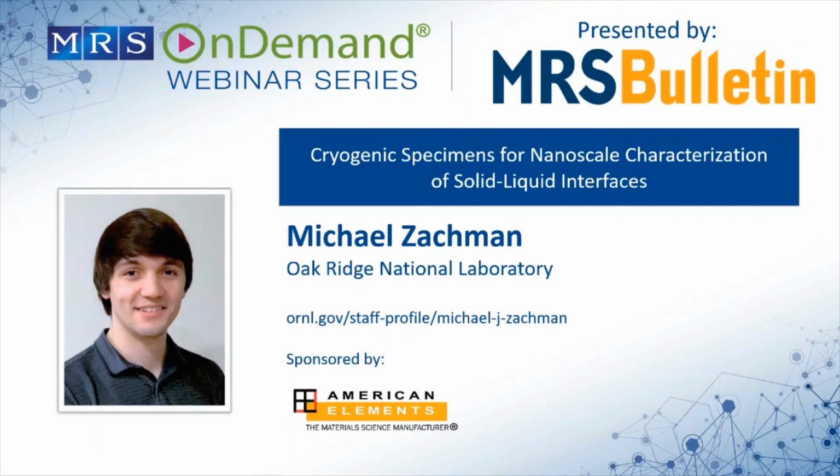I think they have quite a few papers that talk about breakdown of that molecule in the electrolyte. Okay. And then sticking with chemistry, the last question is, someone's asked, doesn't lithium react with nitrogen? And how do you avoid issues with that? I have to say, we worked with Lynden Archer's group at Cornell, and this was the very first question he asked us. Because it's a very good question, a very important question. So what we found was that, no, it doesn't actually. If you freeze it fast enough, that prevents any reaction. We didn't find any nitride on the surface of it, which was actually a little surprising to us. So just the rapid drop in temperature, it didn't.